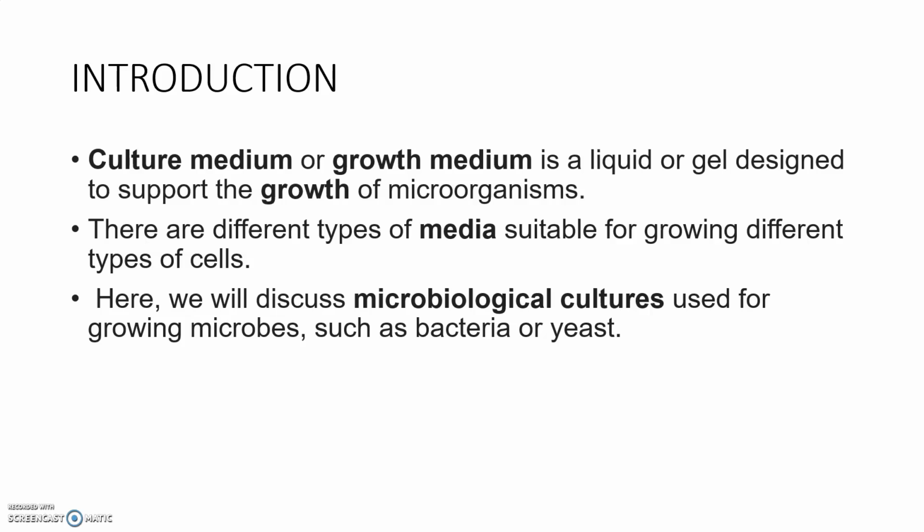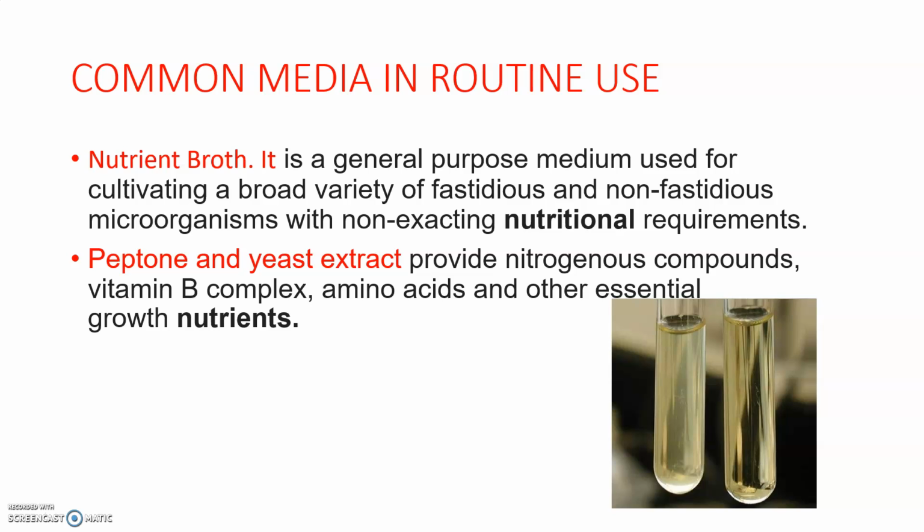In the last few classes, we became familiar with the types of culture media, preparation, etc. There are different types of media suitable for growing different types of cells. Here we can discuss some of the microbiological culture media which are used for growing microbes, especially bacteria or yeast. Now, coming to the common media used in routine use.